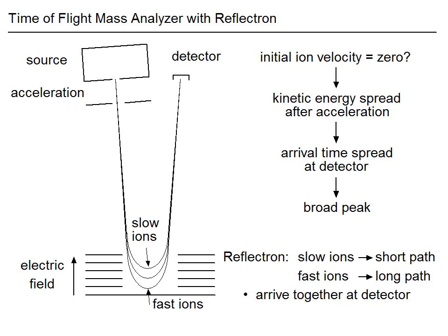Thanks to the Reflectron and a couple of other improvements of the time of flight mass analyzer, these instruments can now reach resolutions of up to 50,000 or sometimes even more.